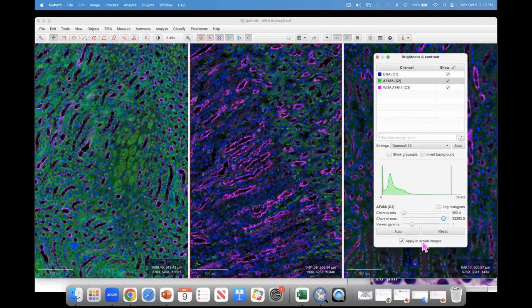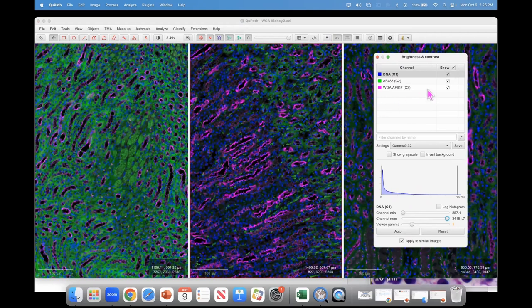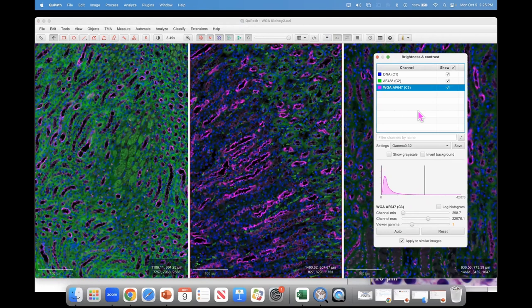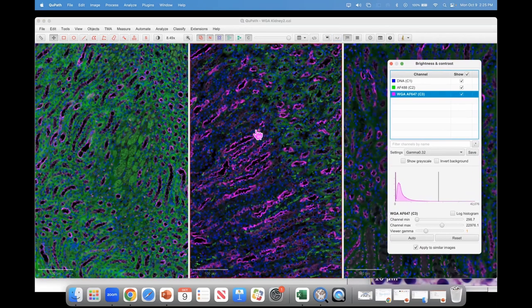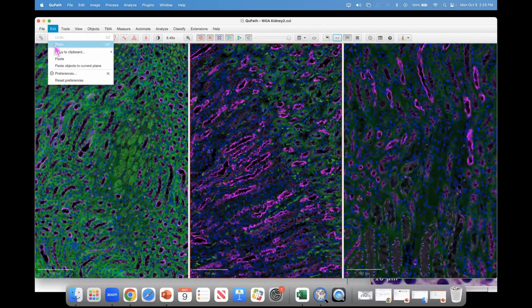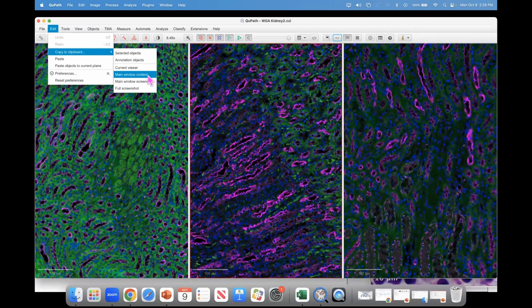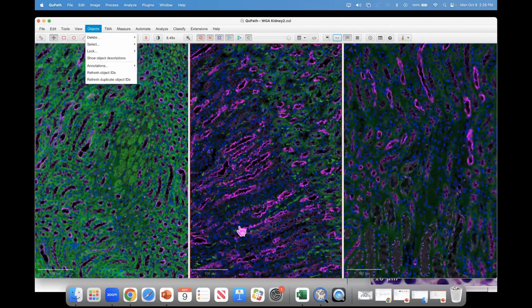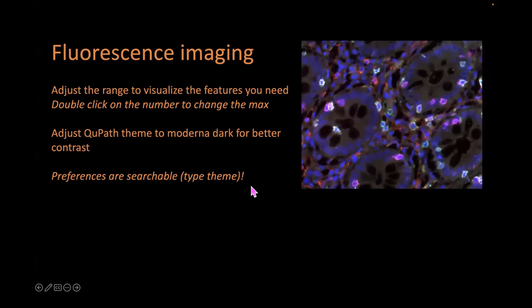If 'Apply to Similar Images' is checked and you change something in Brightness and Contrast, it will apply to all of those images at the same time. This saves an enormous amount of time. We often need to share results of experiments with collaborators, and I can add my control, my staining, and my autofluorescence — however many conditions — and adjust them all simultaneously so they're all the same. Then go to Edit > Copy to Clipboard > Main Window Content to copy everything you see and paste it into an email.